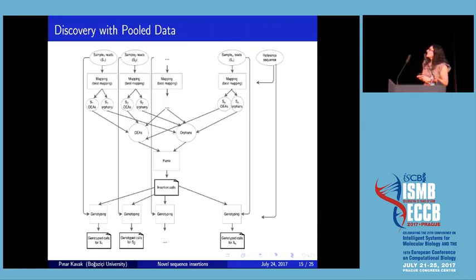In fact, our design is so flexible such that with the following modification, Pamir can be extended to discover novel sequence insertions in multiple individuals from the same population. After getting the best alignment outputs for each sample, we extract the one-end anchors and orphan reads from each sample and combine them in two groups of one-end anchors and orphans. We follow the same procedure until genotyping, and at the end, we genotype each sample individually.